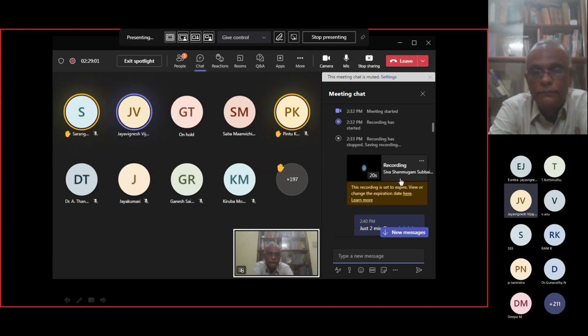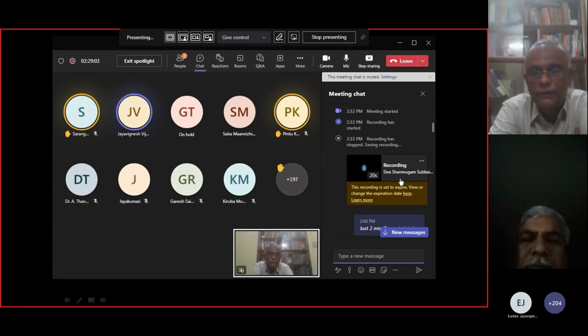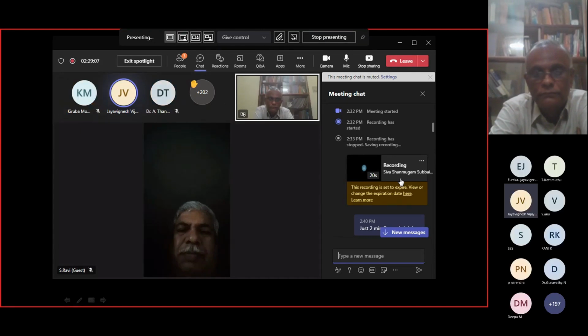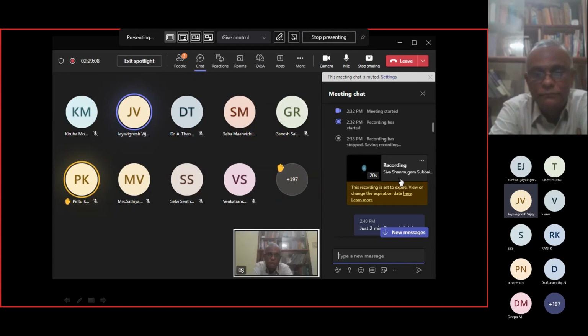Sir, we have a question from Ms. Lavanya. You have told that TLC has a lot of advantages, but in which cases does HPLC become essential?